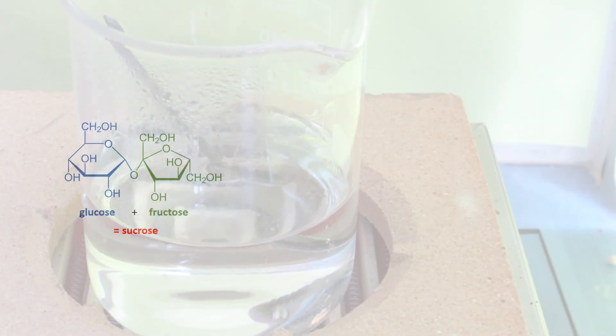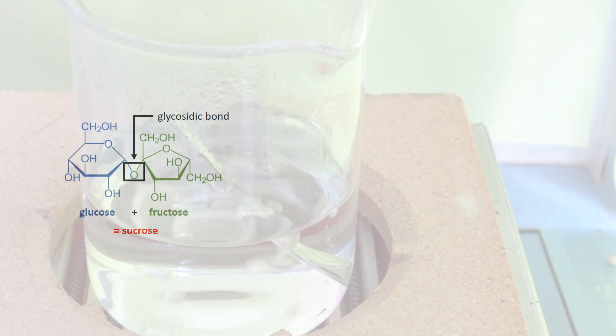Table sugar is actually pure sucrose which consists of two parts: the glucose on the left and fructose on the right. They are linked together by an ether bond called a glycosidic bond. While fructose and glucose are reducing sugars, the glycosidic bond actually makes sucrose not a reducing sugar. The citric acid we added acts as a catalyst for the hydrolysis of sucrose.